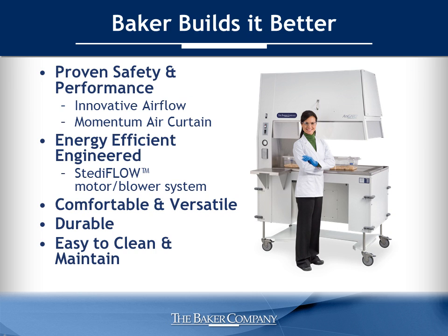Baker has a reputation for quality — we build it better. The AniGuard E3 includes exclusive technologies and features you have come to expect from us, including airflow that delivers proven safety and performance, energy efficiency, and an ergonomic design for ease of use and increased productivity. Let's run through some of these features in more detail.